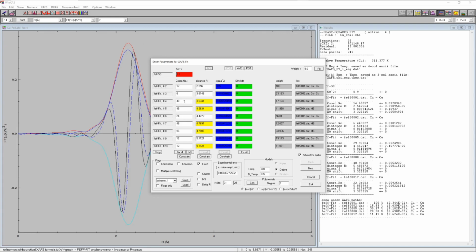We can do the same with the coordination number. This is here, the multiple scattering for the coordination number. So now we have our number of parameters down to 12 compared to the 29 independent parameters. That is decent. We still have a correlation between the Debye temperature and the coordination number, but that should be fine. With the refinement, we can select the parameter of 4 for the E0 shift as a starting parameter, and then we can give this a go.